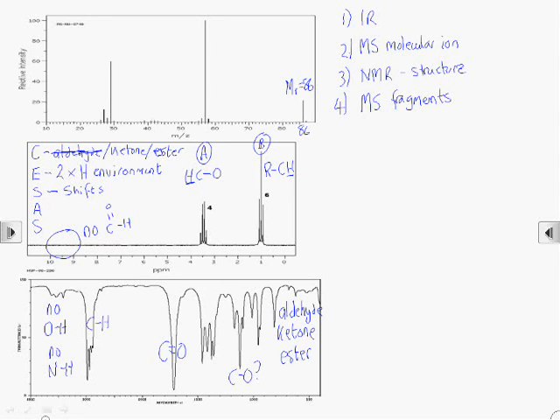And now we need to use the area information. The area under the peak tells us how many hydrogens are in each environment. But before we move on to that, just notice that we've got a carbonyl peak in the infrared, but no protons or hydrogens next door to a carbonyl have shown up in our NMR yet. So we've got another little problem to resolve.